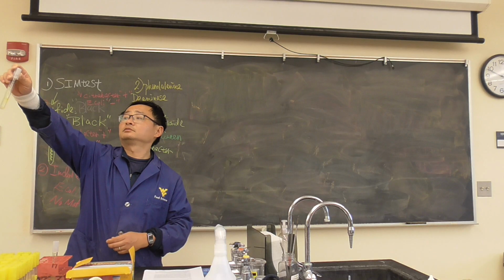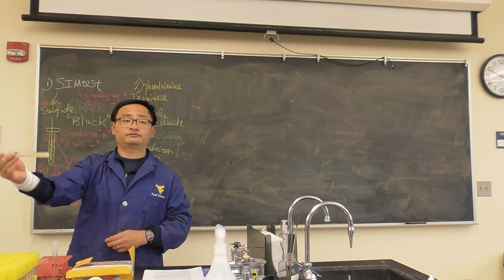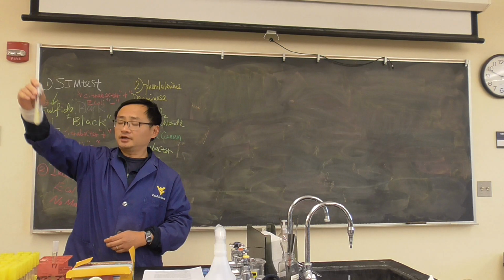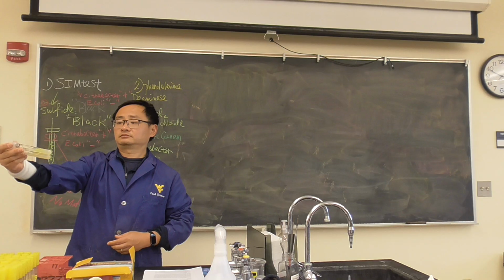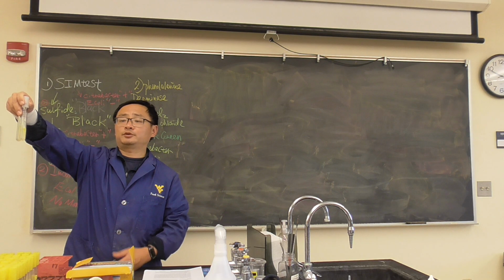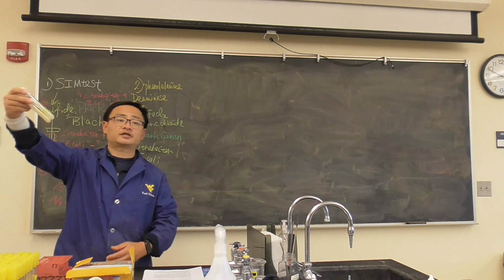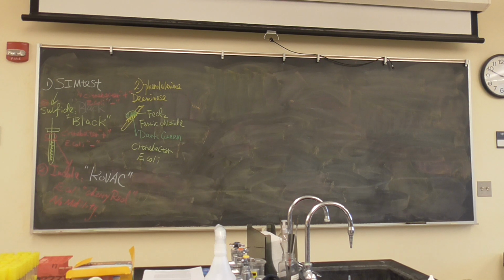Not really. What we find here is both of these are negative. Ideally, one of them should be positive. So I just want to tell you, Proteus vulgaris is positive, but we can't do it. Here we have a negative, that's fine. Negative is negative. We respect our results.